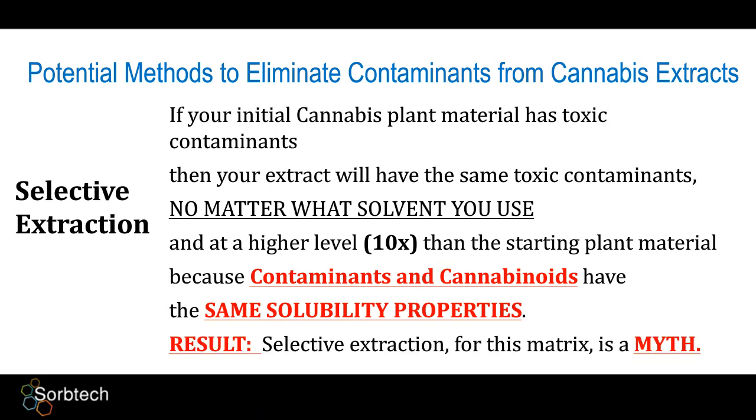The result is that selective extraction for this matrix is a myth. Even with CO2 extraction, under these conditions CO2 is a liquid, so this is solvent extraction.